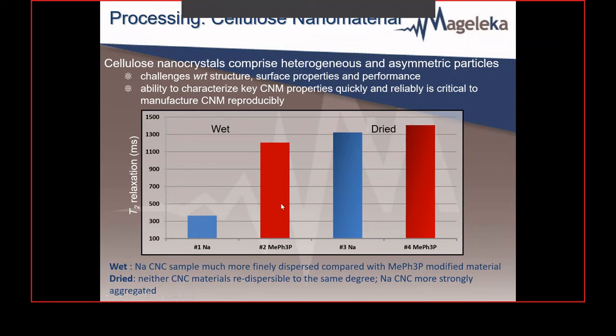more hydrophobic. And we know this because we've got data from inverse gas chromatography, which shows that when you put this methyl ligand on, it results in a decrease in the dispersive component of surface energy, in other words, making it hydrophobic. Now, why would you make it hydrophobic? Because these CNCs are used in aqueous systems, but a lot of CNCs basically want to be dispersed in polymer melts. And so you need surface modification to allow it to be put into the melt.